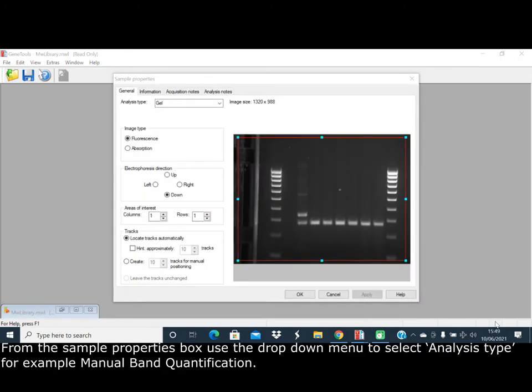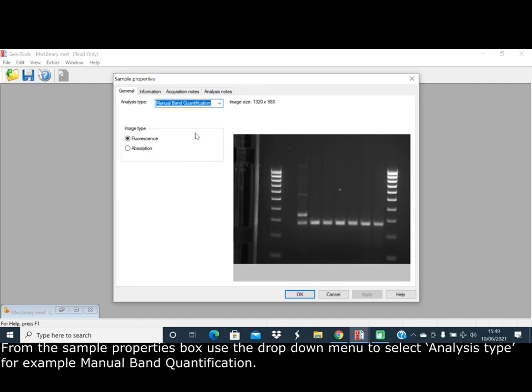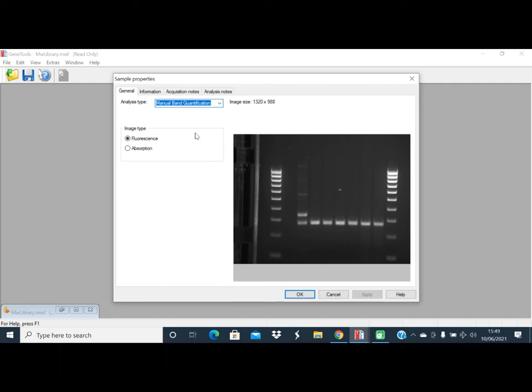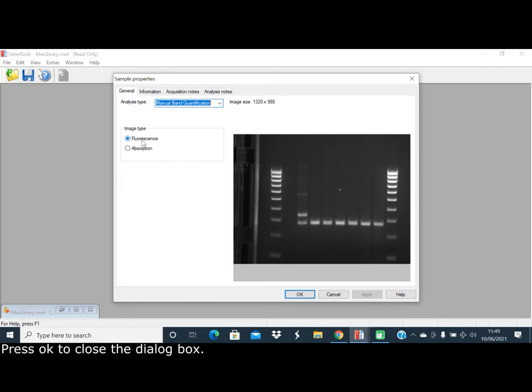From the sample properties box, use the drop-down menu to select the analysis type, for example manual band quantification. GeneTools should automatically detect the image type as fluorescence or absorption. Fluorescence is when you have white bands on a dark background, and absorption is when you have black bands on a white background. Press OK to close the dialog box.